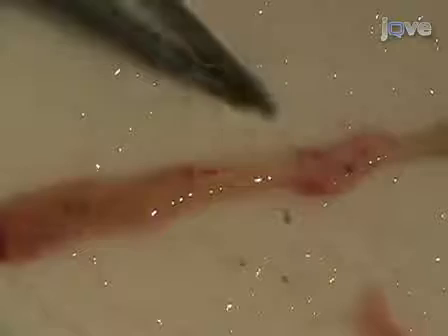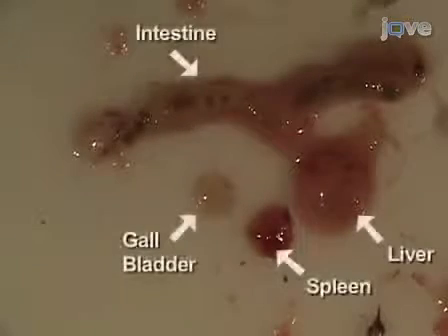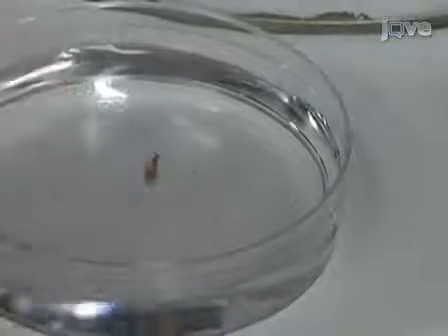Separate the intestine from the rest of the organs and stretch it out. The anterior, mid, and posterior regions of the intestine are defined by the height of the epithelial folds, with the anterior being the highest. Place a piece of the intestine in PBS and observe the epithelial folds under the microscope using transmitted light.